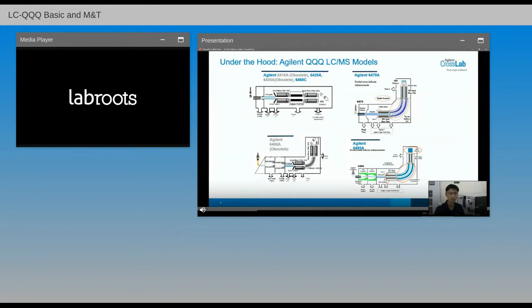First, apologies, a bit of a correction in terms of the terminology. We have two mass analyzers, so we'll actually have an MS1 and an MS2. LC-QQQ is called QQQ in this case, when we only have two quadrupoles that are in fact on the instrument itself, because the second Q is actually part of the so-called collision cell. That's why it's called QQQ.